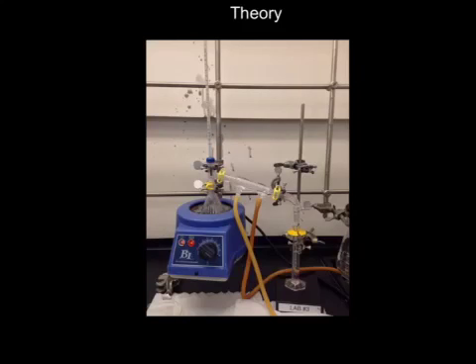The two main kinds of distillation are simple distillation and fractional distillation, and both are used widely, but both have their advantages and disadvantages. Some advantages for simple distillation are that it is faster and less energy consumption is needed, while fractional distillation provides a much better separation between liquid and a mixture, and can purify better.